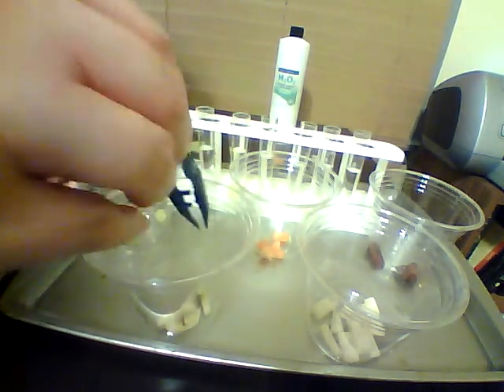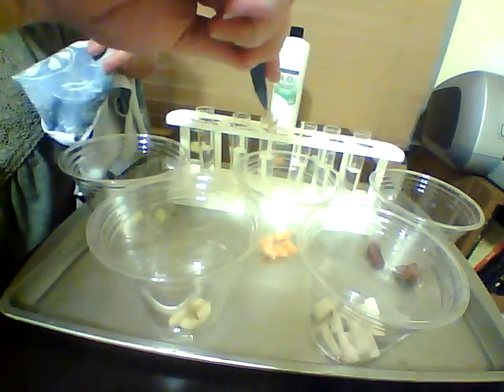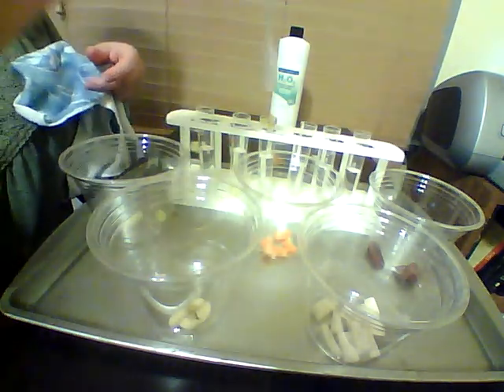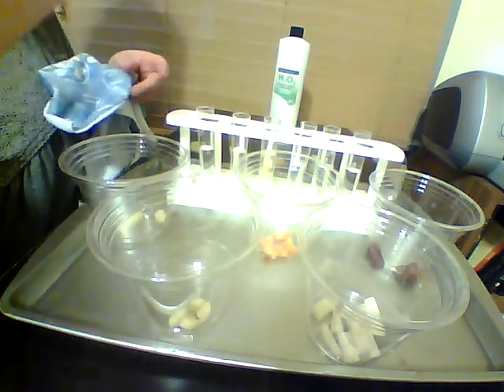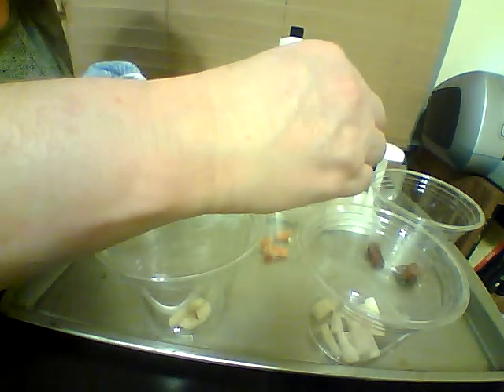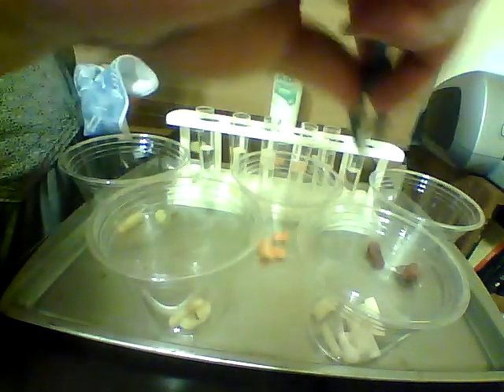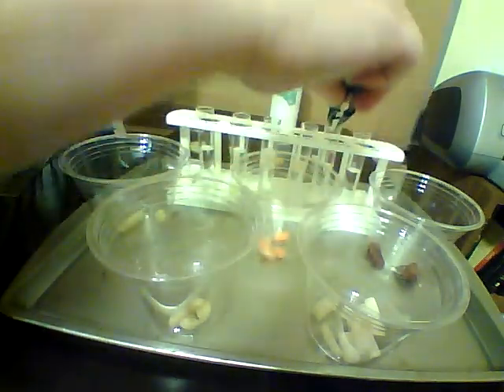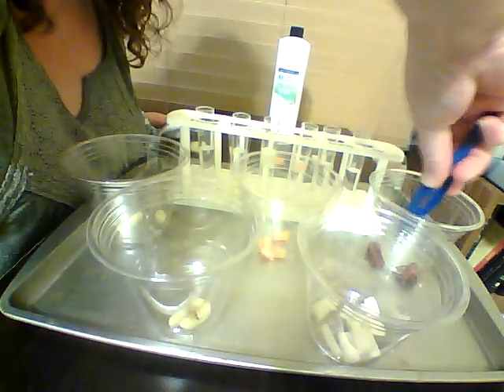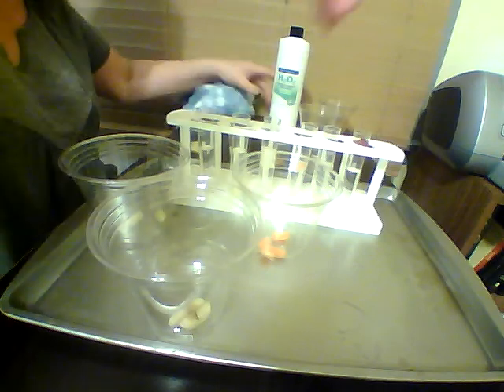And I'm going to drop a banana into the next one. Oh, bananas are a little mushy. I'm going to put it down in there. All right. We'll put in a carrot, a piece of potato, and a piece of liver.